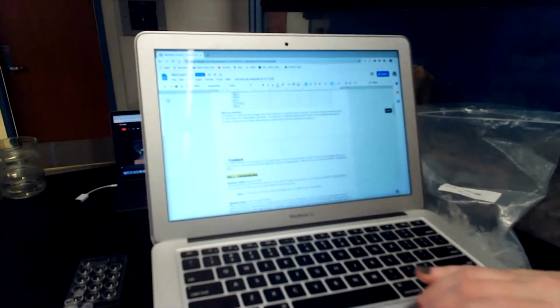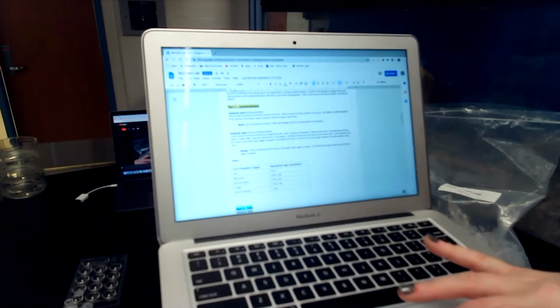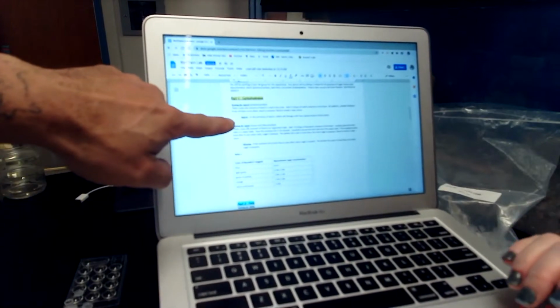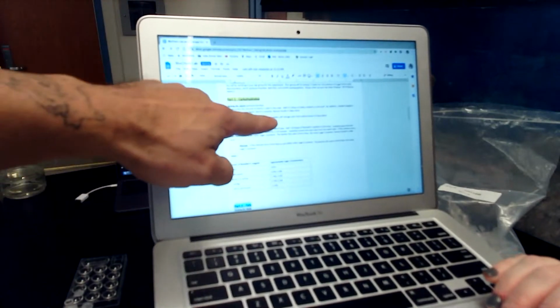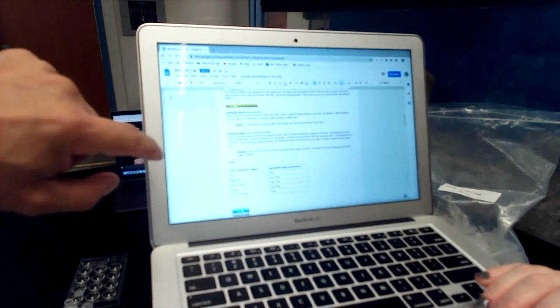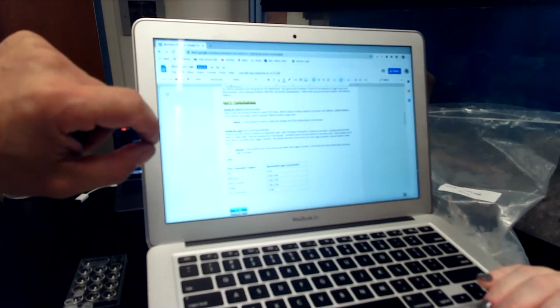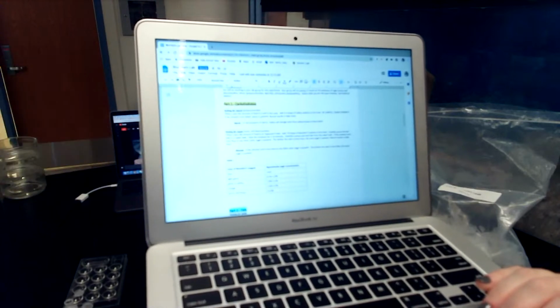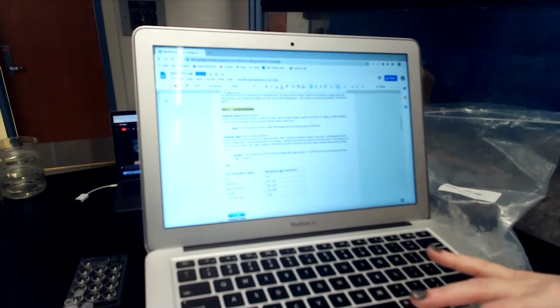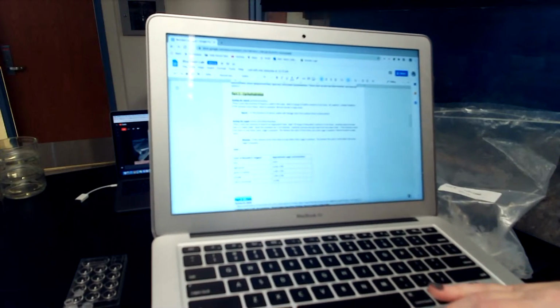Yeah. All right. So following along in the lab, we're going to be doing part one today, carbohydrates, testing for the presence of a starch or a sugar. If it's a starch, we're going to use iodine to test it. It's going to change from yellow to brown to blue to black. When we're testing for sugar, we're going to put a little bit in a tube, use this Benedict's solution, and heat it for 5 to 10 minutes. Then we're also looking for a color change. Depending on how much it changes in the chart is how much sugar is present.